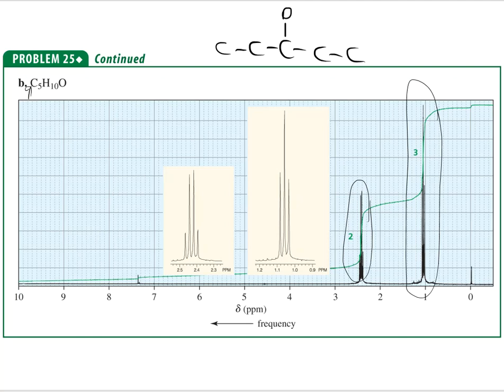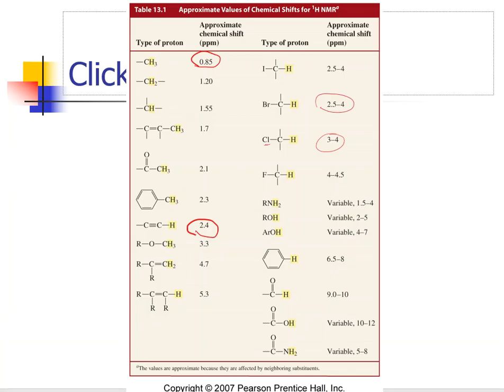All right, now the other option, if this was a double bond O, that would be a ketone, right? So I'm going to go back to that chart, and I'm going to look for a ketone functional group, and we're going to see where that ppm might be located as well. So that will help us make that decision too. All right, so let me flip back to the chart, and I need to find a ketone, just a C double bond O. That is it. That's all that I want.